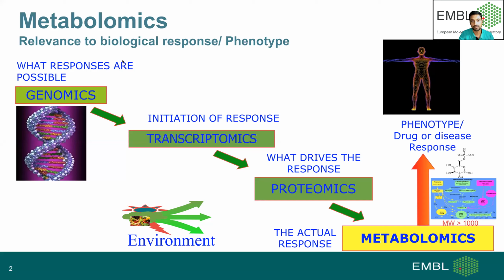But what happens after proteins or enzymes have done their job is there are leftovers or footprints, which can be defined as a phenotype of any drug, disease, or biological process. These phenotypes are captured by metabolites, small molecule metabolites and lipids, and they are very close to your phenotypic response.